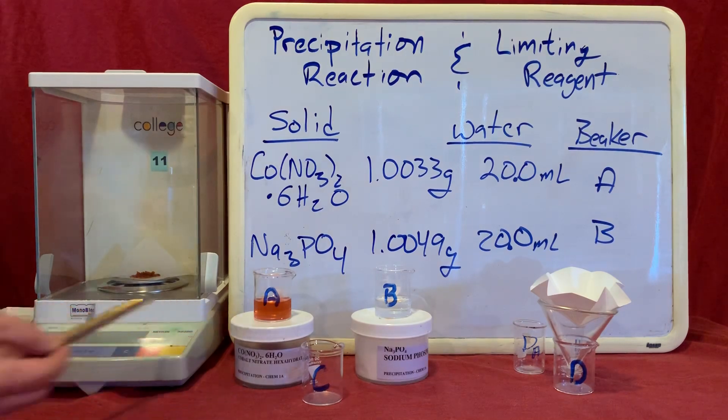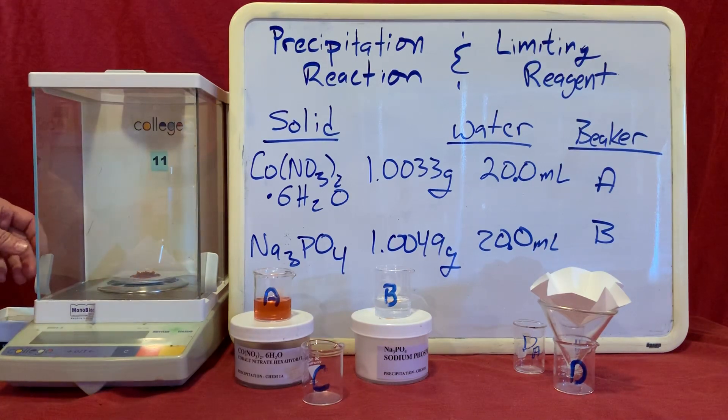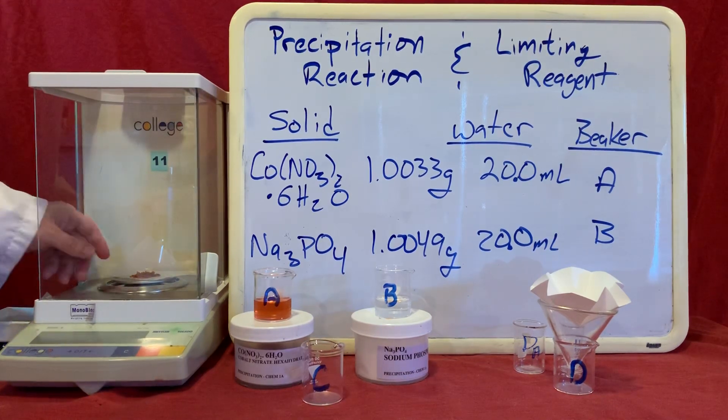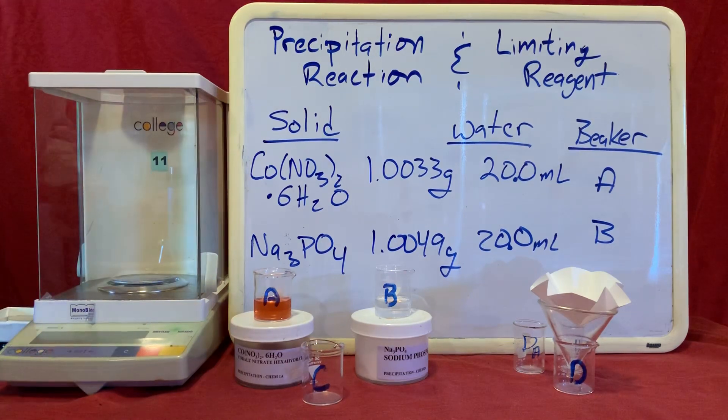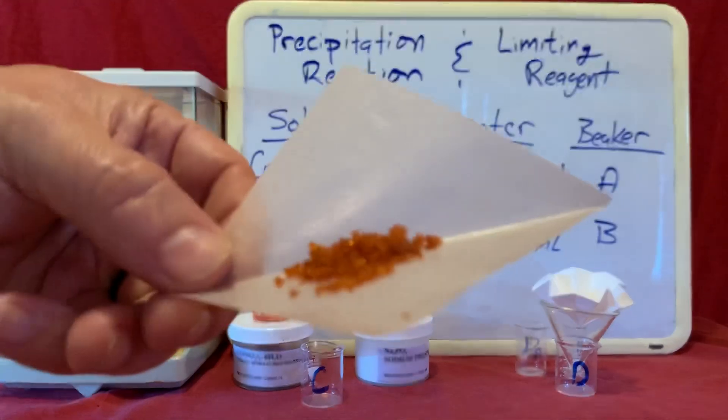Solution A is going to be made of cobalt-2 nitrate hexahydrate and water. We're going to make this solution by starting out with approximately one gram of the cobalt-2 nitrate hexahydrate. I've measured out a representative sample here on the balance, and you can see what the solid looks like.